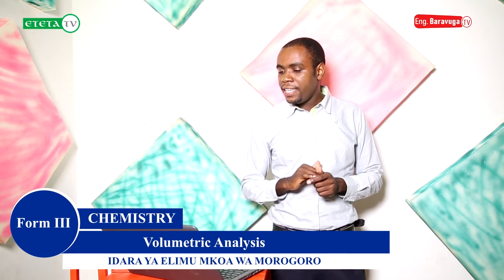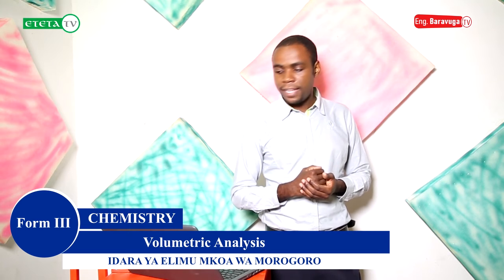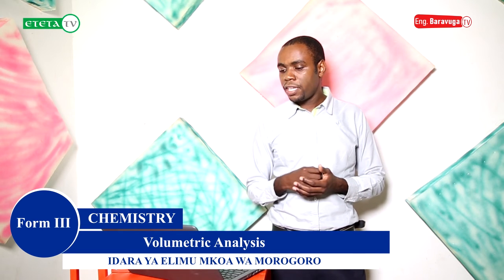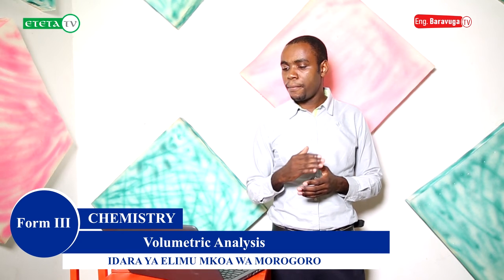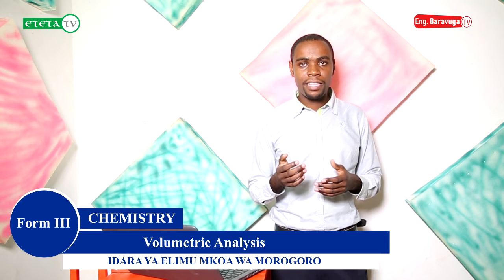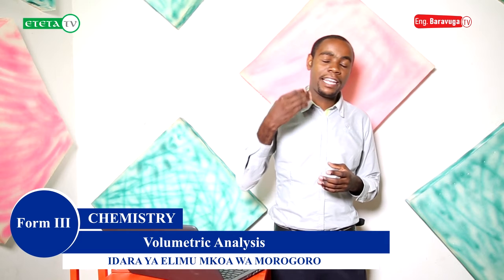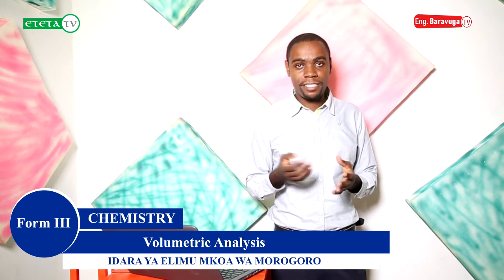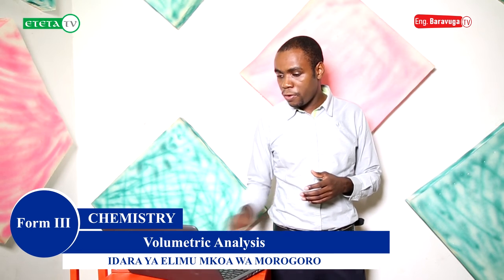Another apparatus is the volumetric flask, and the function of the volumetric flask is to make up the solution to a total final volume. Some volumetric flasks can measure maybe 100 mL, others can measure 1,000 mL. So this one is used to make up a solution to a total final volume.